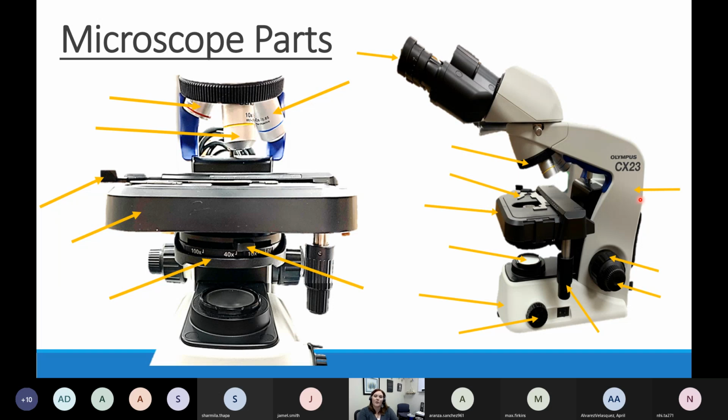When you get the microscope to your lab bench, you're going to look into that microscope using this part that's sticking up here. This is called the oculars. So the oculars are the part of the microscope that you look through to identify specimens. I'll mention that the oculars by themselves can make things 10 times bigger. So if we took the ocular off of the microscope and put it by our eyes and peeked through it, anything we looked at would be 10 times bigger than it is in real life. The oculars, what we look through, make things 10 times bigger.